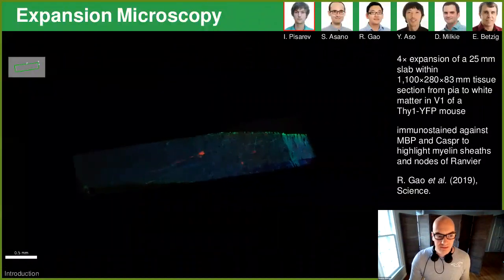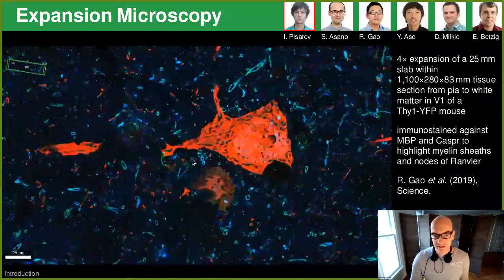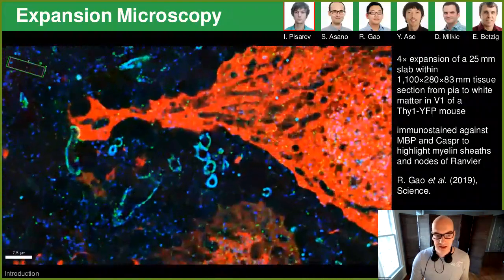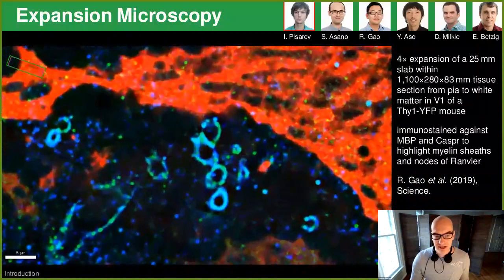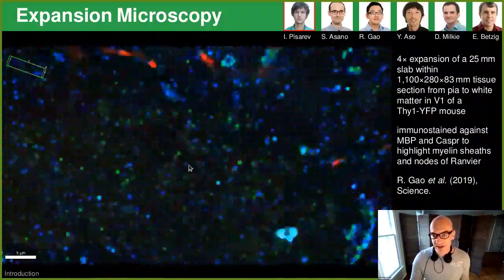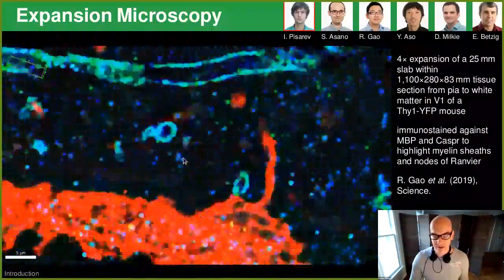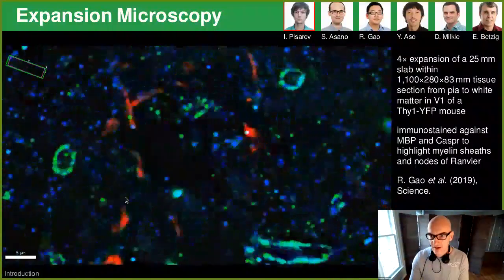And as a last example, we developed the code to stitch tens of thousands of 3D tiles imaged with lattice light sheet microscopy, including a method to estimate and correct the flat field of the imaging system from all the tiles by statistically evaluating the intensity distribution across all pixels.